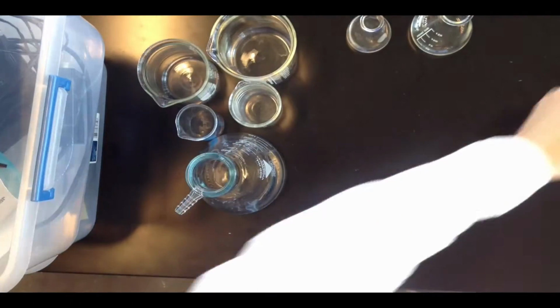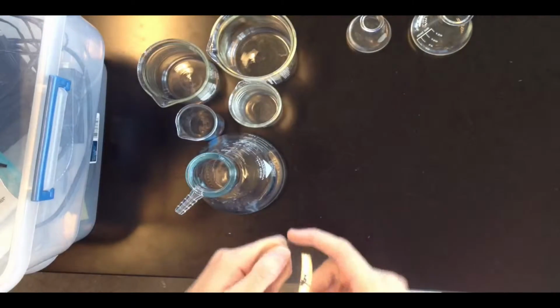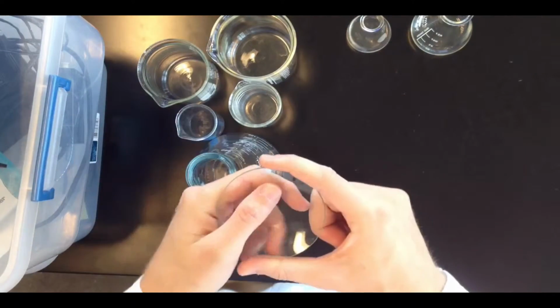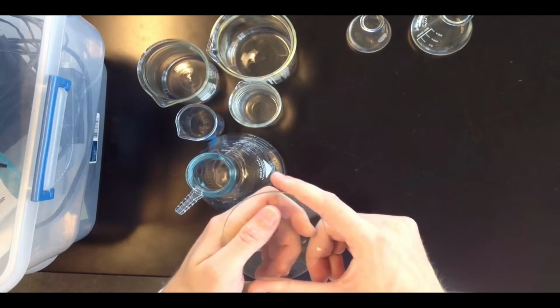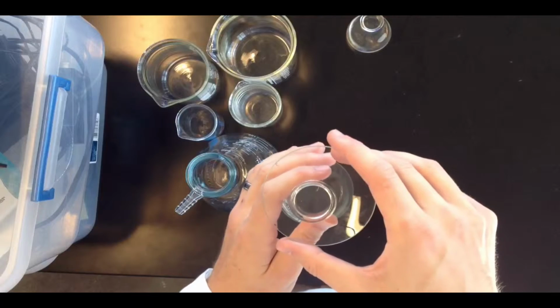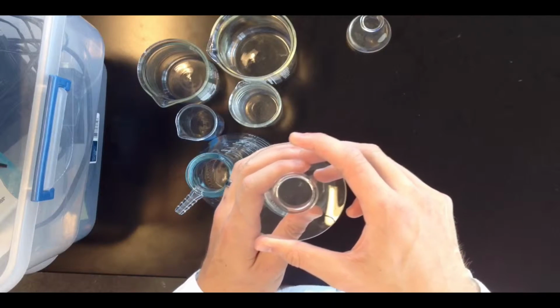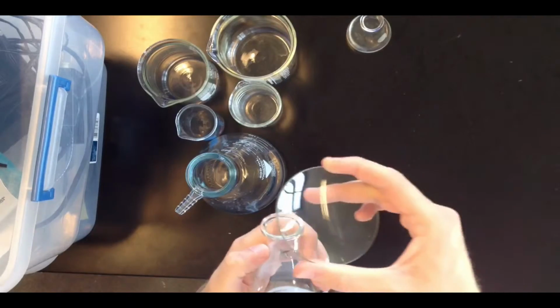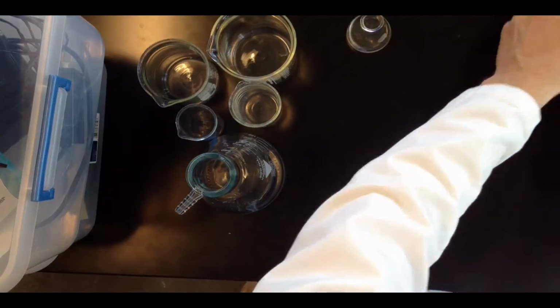A couple of other pieces of glassware you'll use. A watch glass is generally used to hold solids for observation and that kind of thing. It's also sometimes used to close off an Erlenmeyer flask, so it can sit on top of an Erlenmeyer flask like so. We'll use watch glasses mostly just to hold solids to let them dry and things like that.